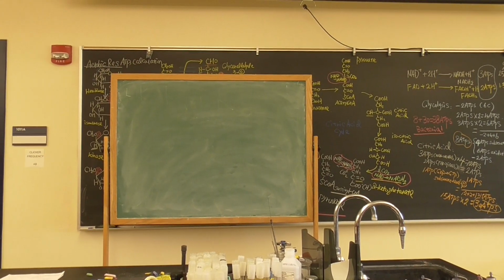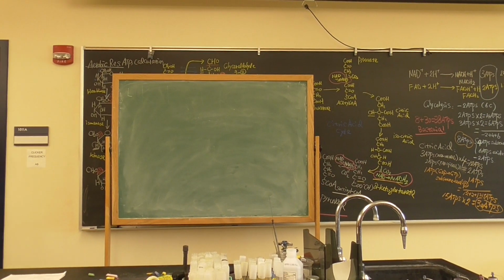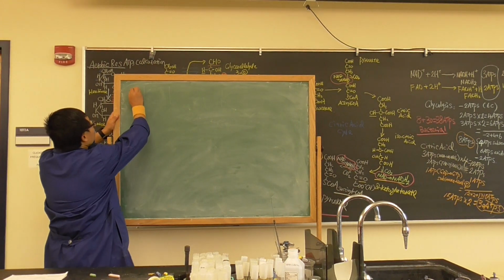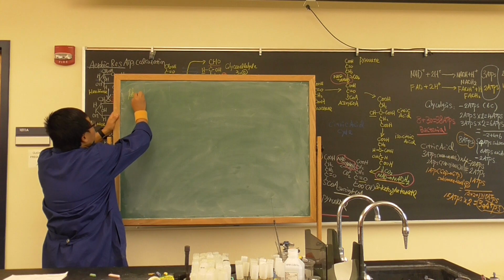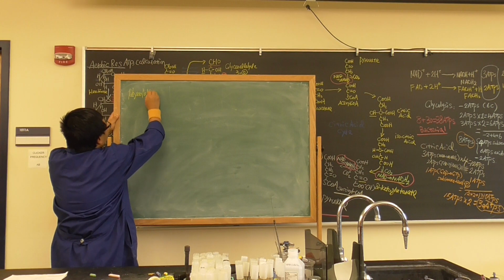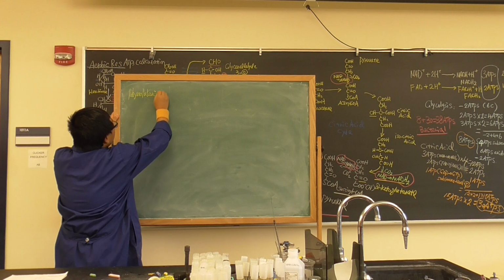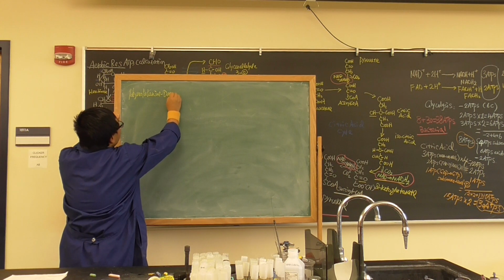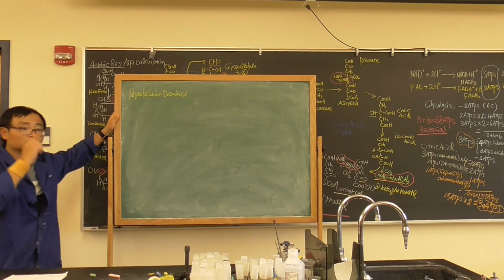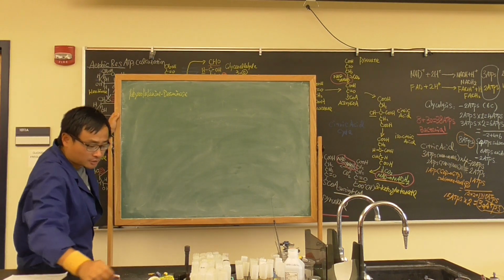Lab section, what are we going to do? First of all, we have to do the confirmation test. Do you remember what we do? Phenylalanine deaminase. Phenyl, that's hard to write. Okay, phenylalanine deaminase, how did we do it?